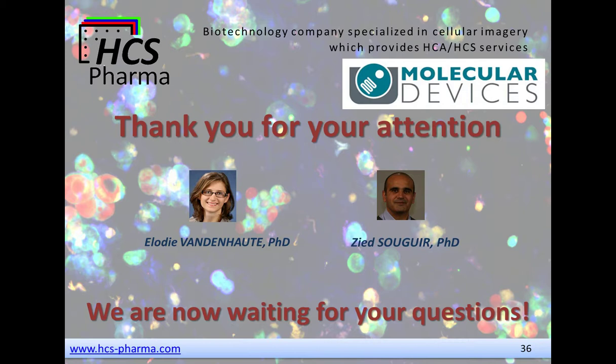If we have a low magnification objective, for example a 4x objective on our systems, we can capture the entire well. So you can take one image per well, or you can go all the way up to 100x magnification, which would then be about 100 images per well, and in that case that'd be about 38,000 images per 384 well plate. I hope I answered that correctly.